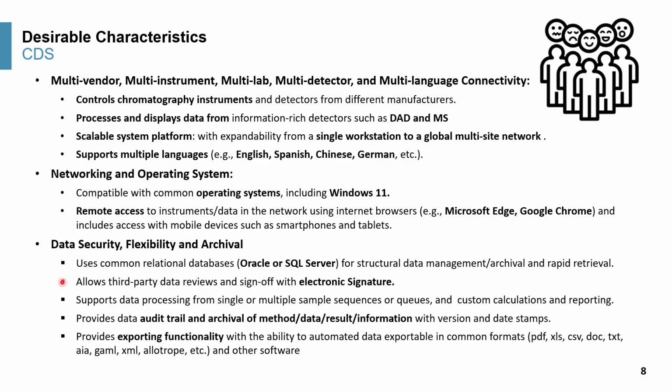Another requirement is data security, flexibility, and archival, using a relational database such as Oracle or SQL Server.